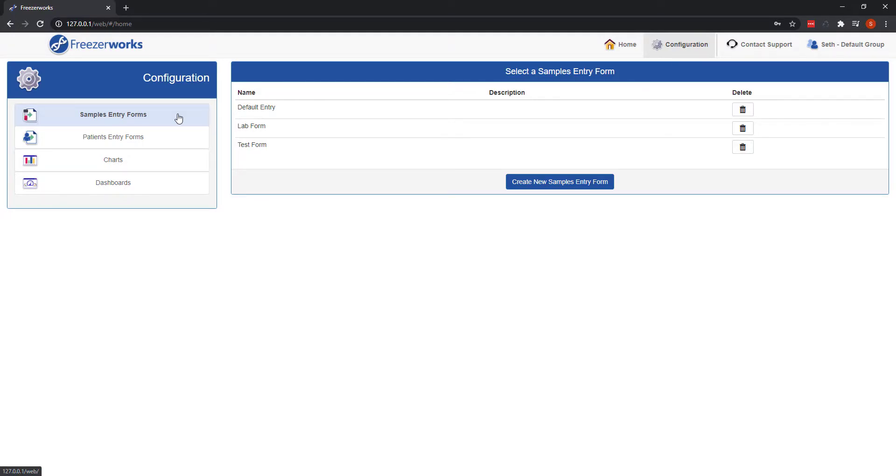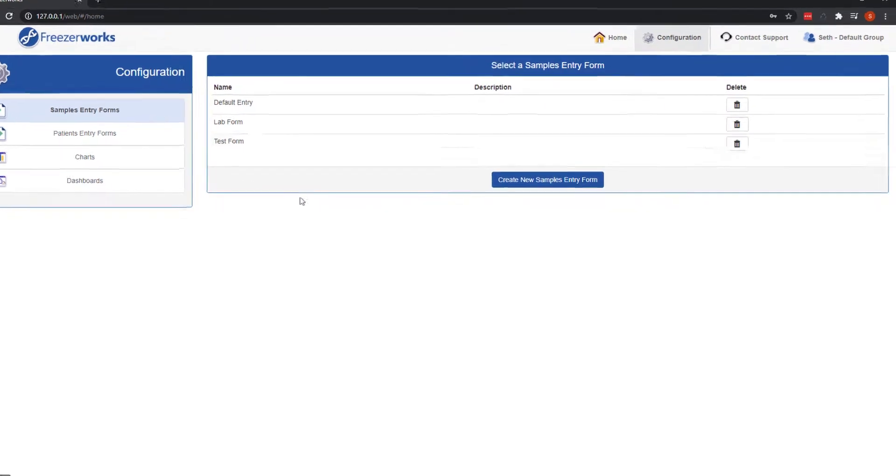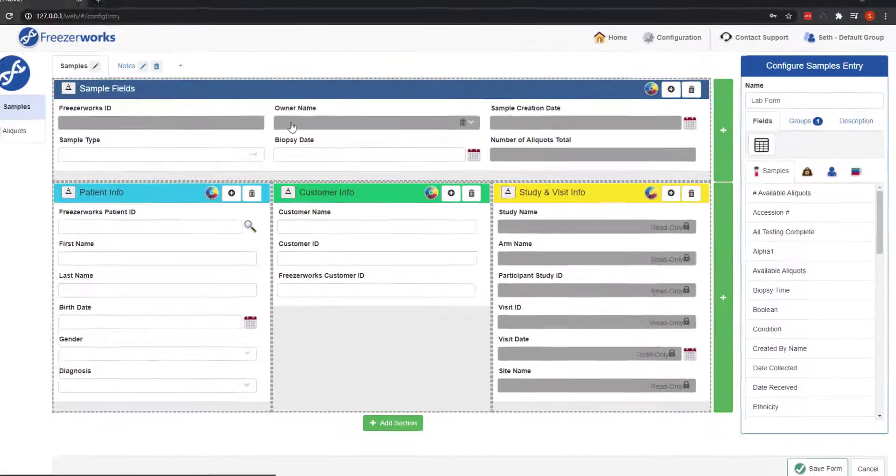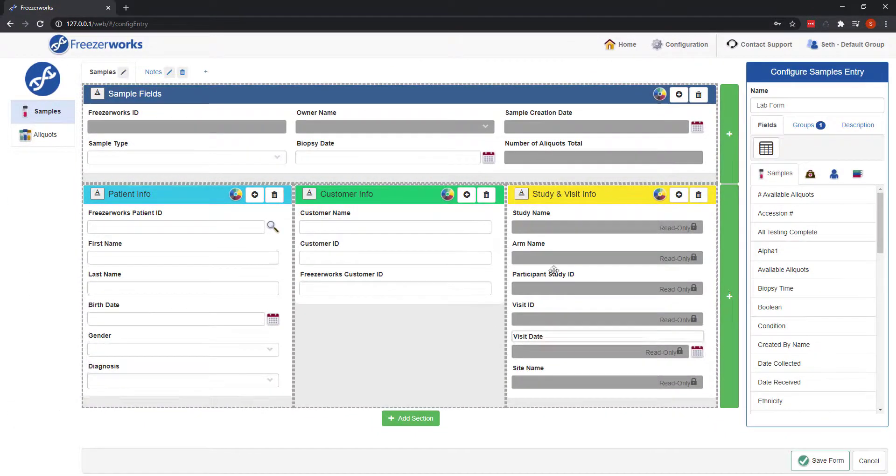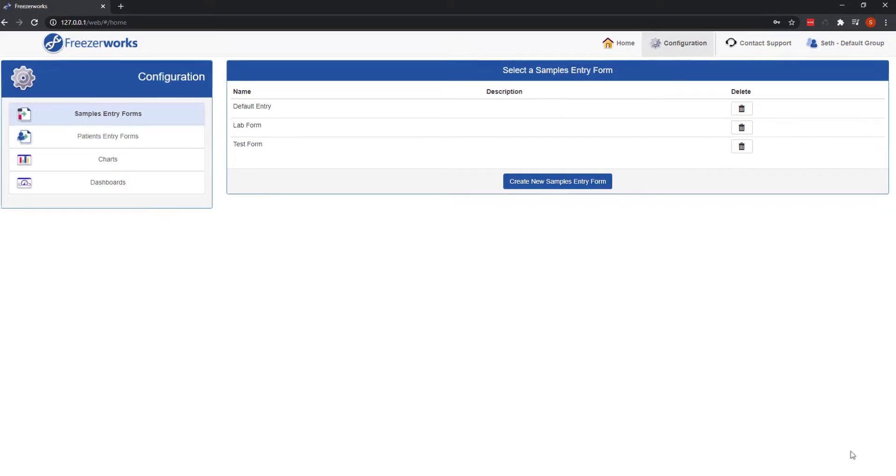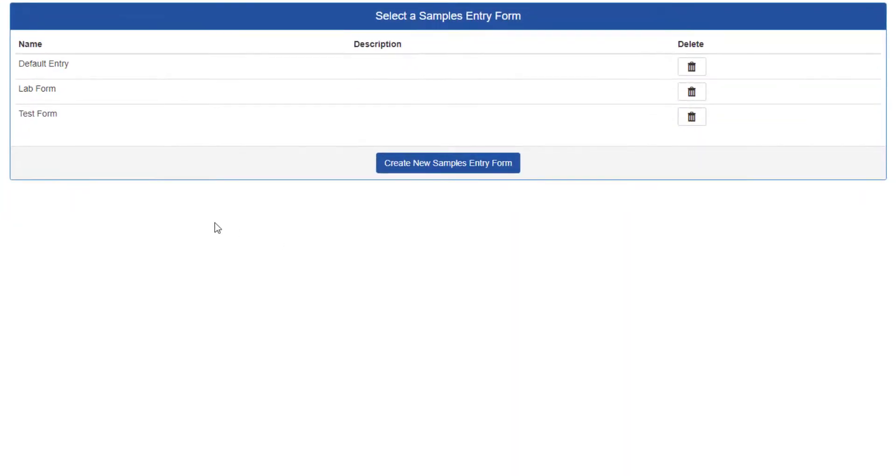For all other editions, you will see this list of existing samples entry forms, which may be blank for you at this point. If you have an existing entry form you want to edit, just click it. Any entry forms assigned to your group will be modifiable. To create a new entry form, though, click Create New Samples Entry Form.